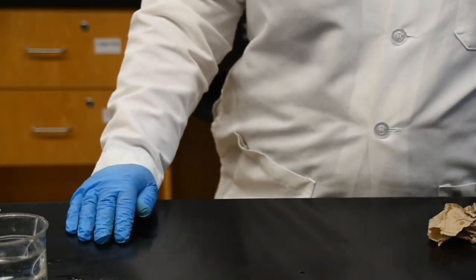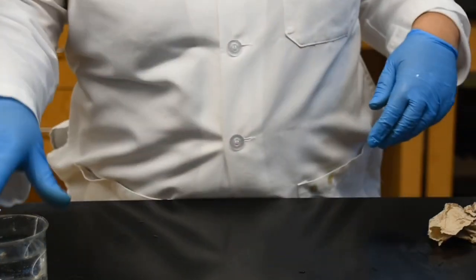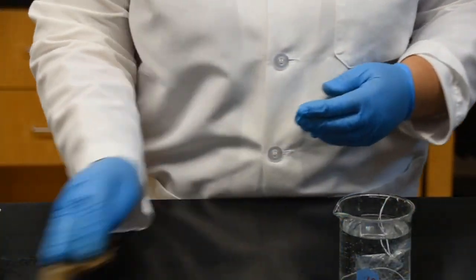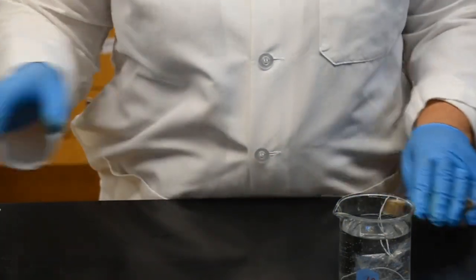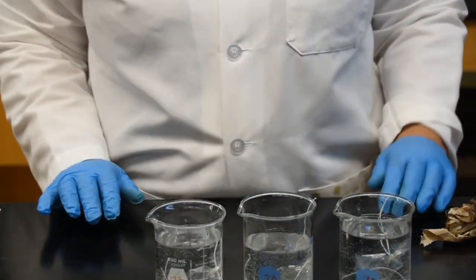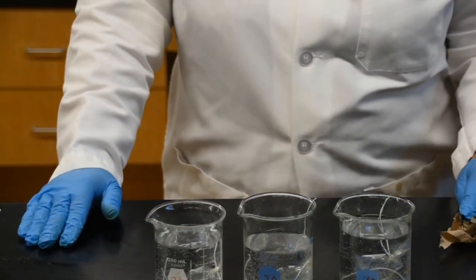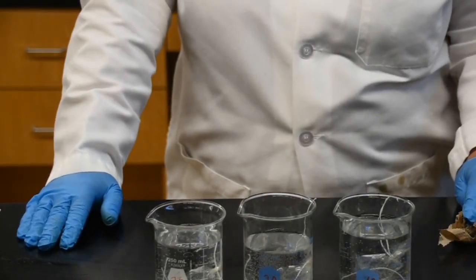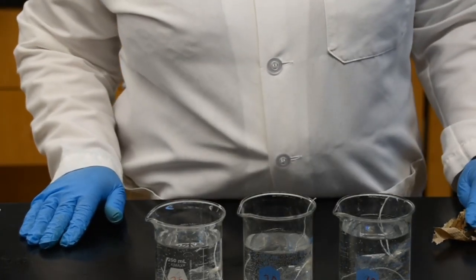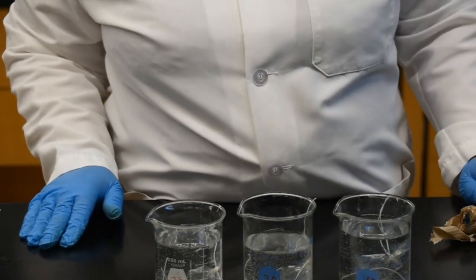Now, the last experiment we did was our three baggies of three different types of sucrose solution. We have the 10%, the 20%, and the 30%. This experiment also ran for about 45 minutes, and I did take a moment to weigh these bags to see what the final weight for each baggie is.